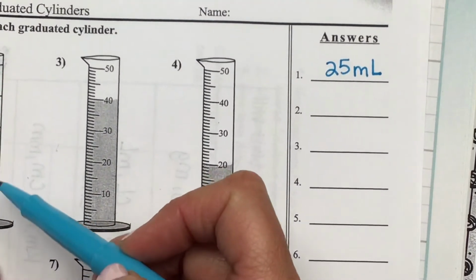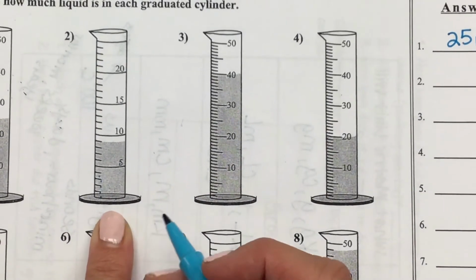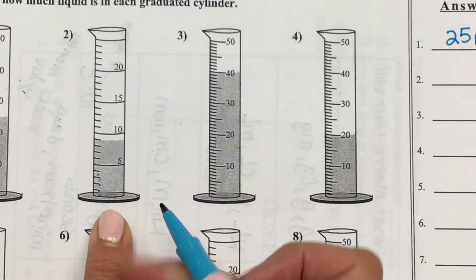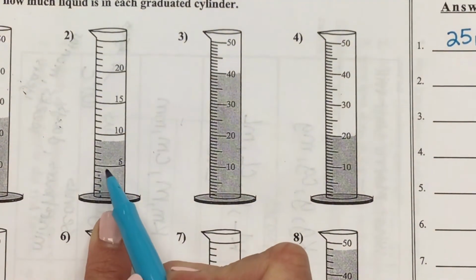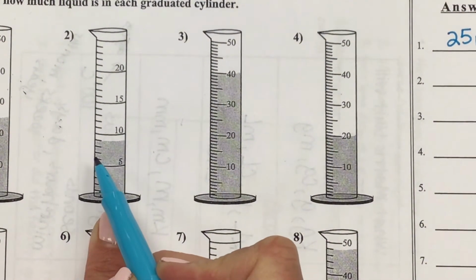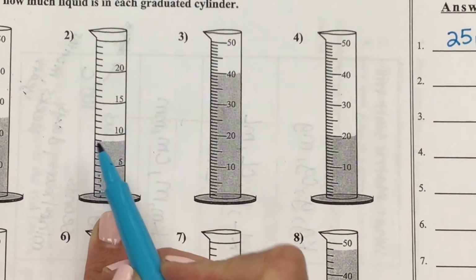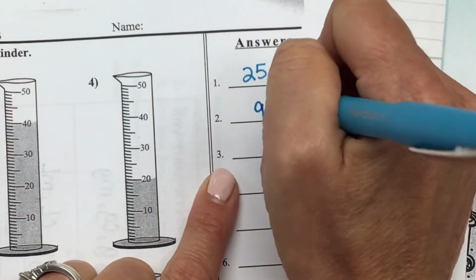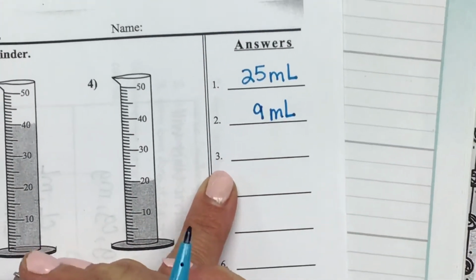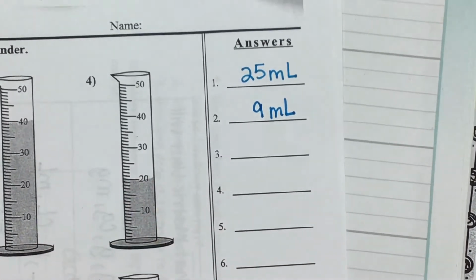What do you think it is? How many milliliters for number 2? Luke. 8 milliliters. I don't think it's 8. Look again. Look, here's 5. Count up. 6, 7, 8, 9. 9 milliliters. Okay, I need you to do your work with me, please.